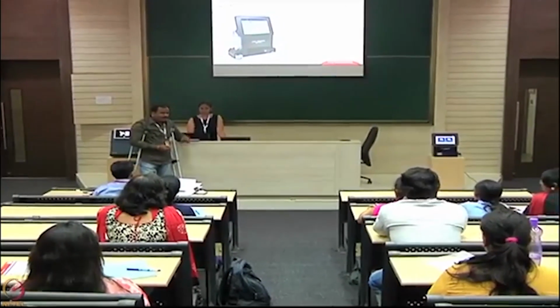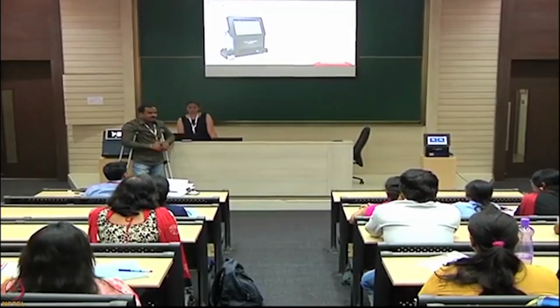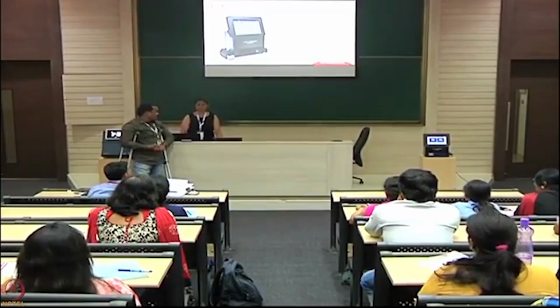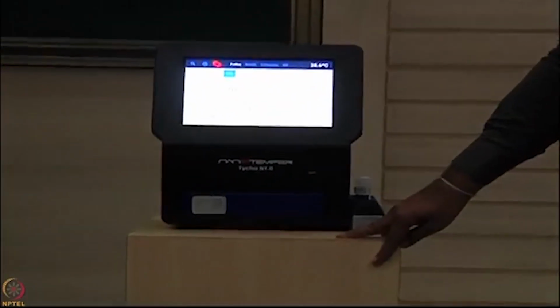Quickly, maybe 3 minutes as I said, she will load 1 sample quickly. By the time she comes here, the sample will be done there. So you just load 1 sample, it's fine. We are showing the previous data to get understanding because we had only 1 BSA.